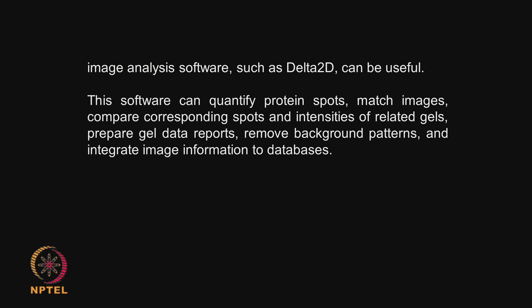Today we looked at a very important set of techniques which are normally used in a molecular biology or biochemistry lab, trying to identify proteins based on the charge, based on their molecular weight and the movement of their diffusion coefficient and so on.